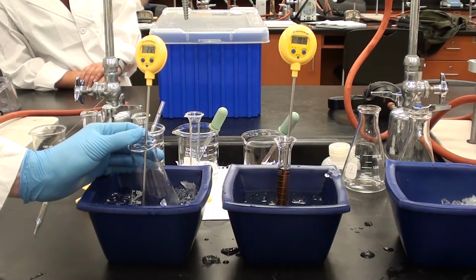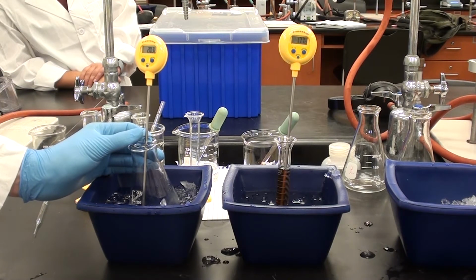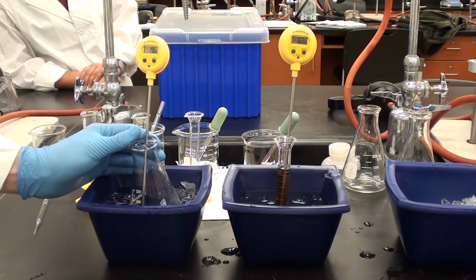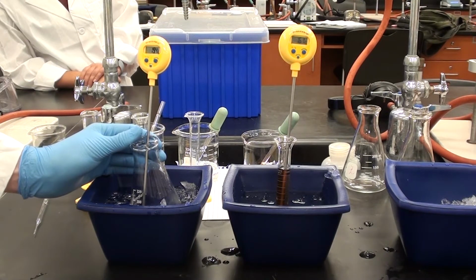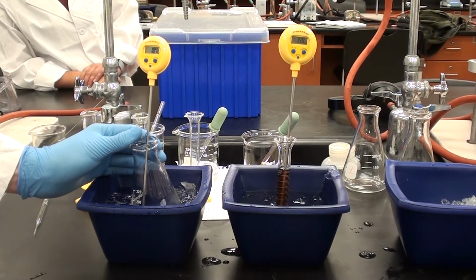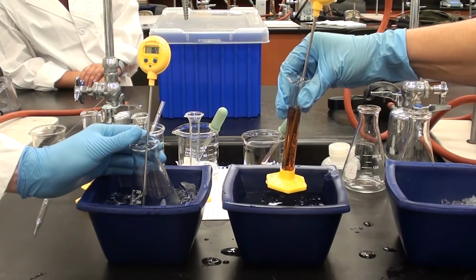So I'm looking at this and I can see that the iodine now is at about 18.8 and the other solution is at about 20.7. So as you can see, the iodine is cooling a lot more quickly. So Julie, once it gets down to about 14, I'm going to ask you to remove it from the ice water. Just hold it above the ice water, okay? So it's about 15 now, that's fine. And the temperature keeps on going down. At around 14, go ahead and remove it. Okay, just leave it out of the water like that for a little bit.